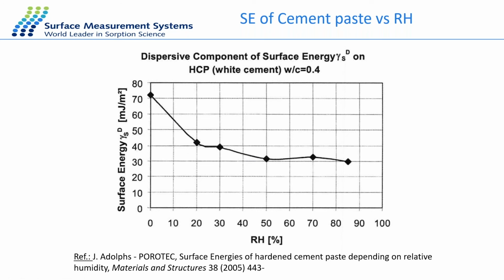We've just got a comment just saying for BET, we must be very careful to choose the appropriate amount of injected octane. So I guess how would you choose the amount of injected octane for BET calculations?